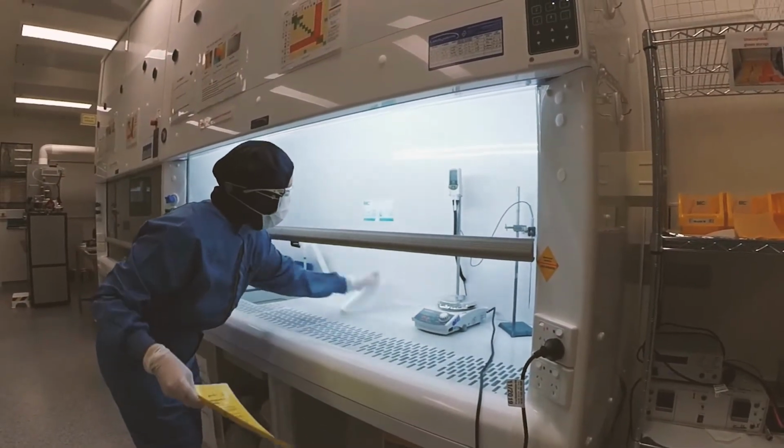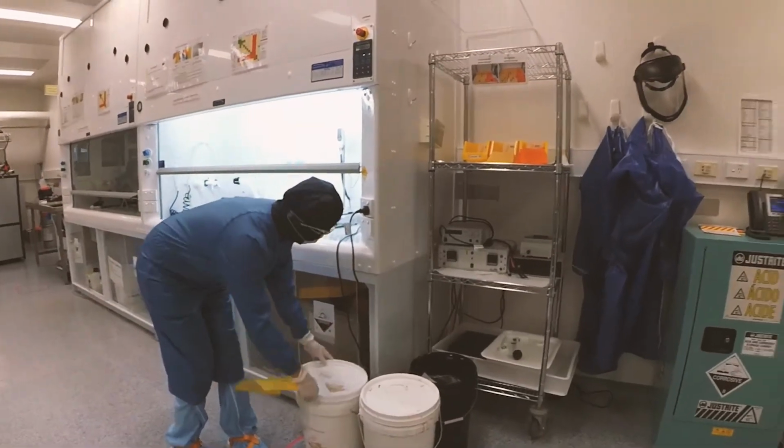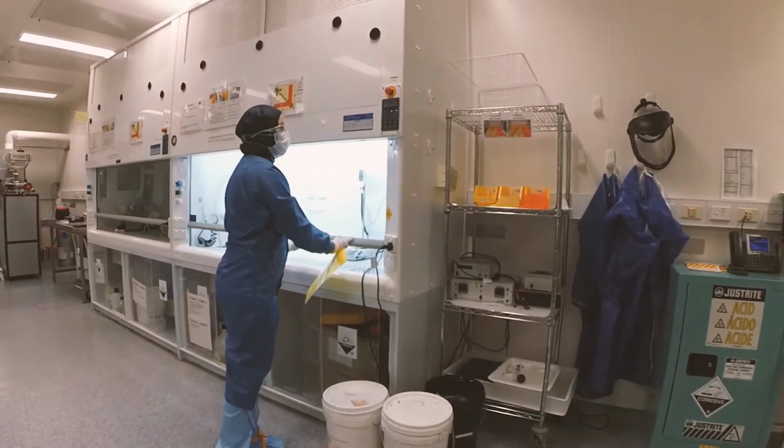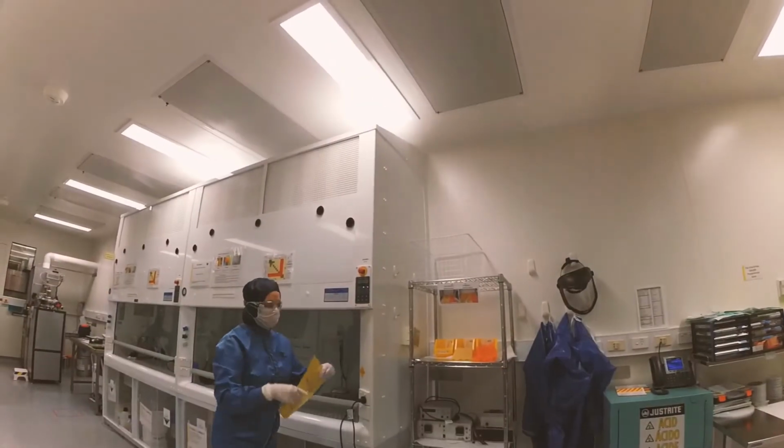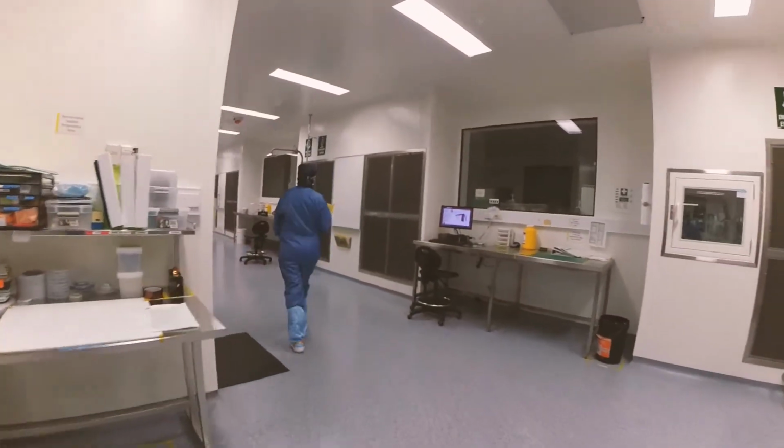MCN is a shared facility. Once you've finished using a fume hood or sample preparation area, make sure to clean and clear the area ready for the next user. Remember to put any items used back in their original places when finished.